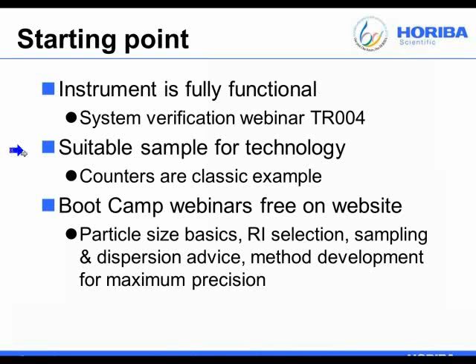And we also will assume that you have a suitable sample for the technology you own. Most of the people in the audience, I would bet, have a laser diffraction instrument. So you have to have a sample in the right size range, you have to have a sample in an appropriate concentration, a sample that can be dispersed well, things like that.